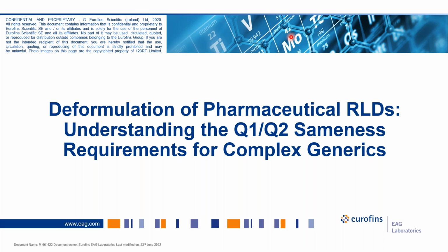For those of you who aren't aware, RLD stands for Reference Listed Drug, and we do a lot of this type of testing here at EAG. We are certainly the world leader in this type of testing, and I'm really excited to go over what we do, how we do it, and why we do it.